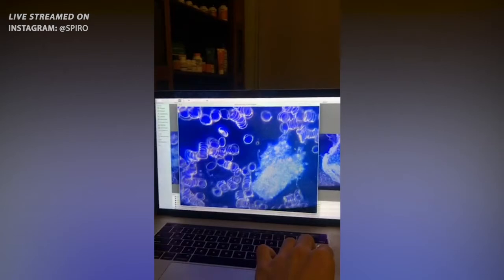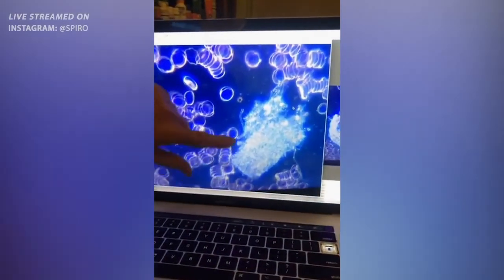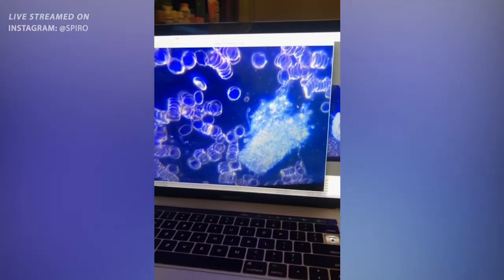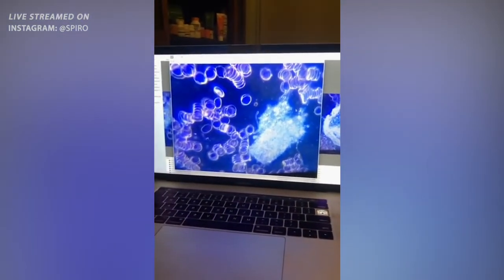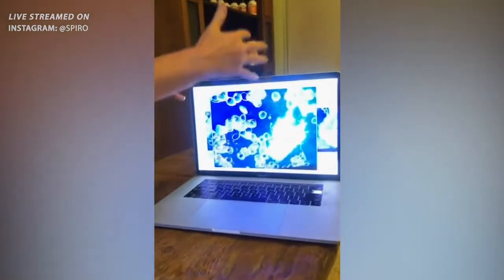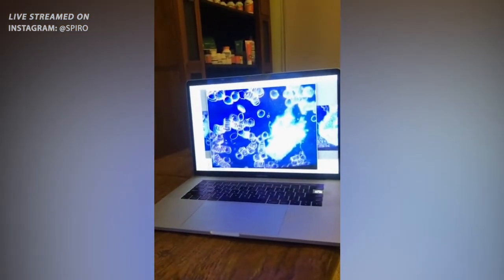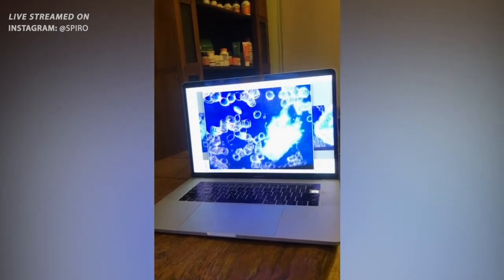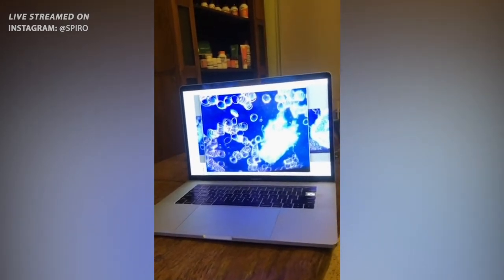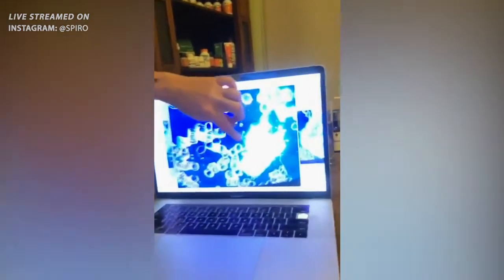Okay, what are we looking at? You see a similar thing, with these growing things coming out of it. Growing? Yes, because these things were growing. If you wait another couple of hours, there would be more. They were definitely growing. So they're alive. It's sort of got a life of its own. Definitely something alive. Was it moving? This thing here wasn't moving, but these things were.